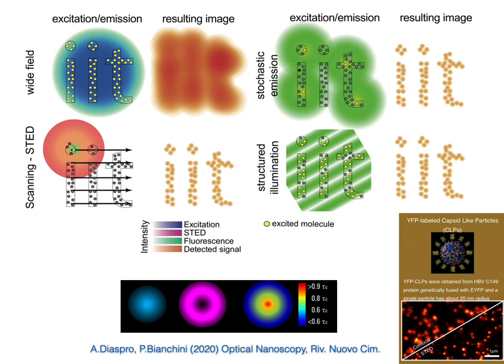In case we write IIT, Italian Institute of Technology, with a wide field microscope, well, maybe with some processing we can go to the IIT. But if you play the three other methods of super resolution, in the idea of Giuliano Toraldo di Francia of adding information about the fluorophore, you can clearly read IIT. But this is not what I wanted to do. Come on, this is what I want to do.